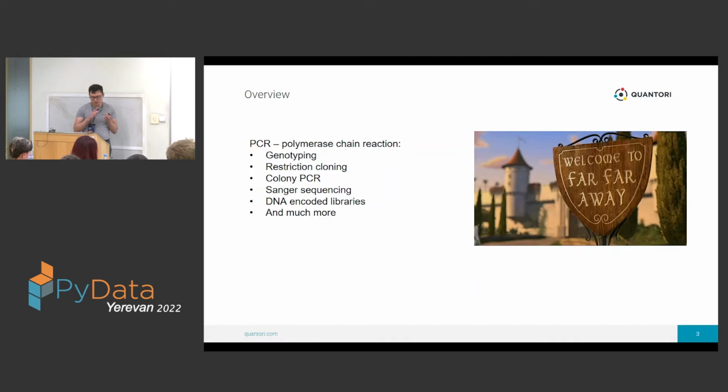For example, if we want to see what mutation is in a sibling's DNA, or you would like to produce some vectors using a predefined template, or we want to see what bacteria are present in different media, or you would like to assess the sequence of different mutations, or you would like to pick up compounds which are tropic to some specific targets in drug design, that's DNA encoding libraries. We could use PCR as the means to achieve our tasks.